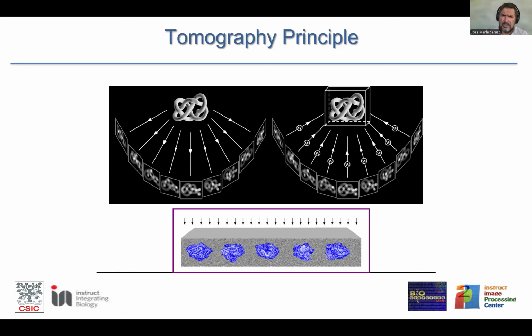You have captured whatever is the state there. But before being frozen, it had been moving, so you have the capacity to study, and this is what we are doing, the capacity to study the flexibility of the macromolecule, and to do that on a time scale. Time is still important, in the range of milliseconds.